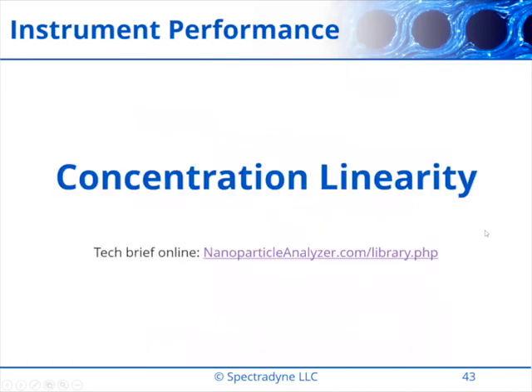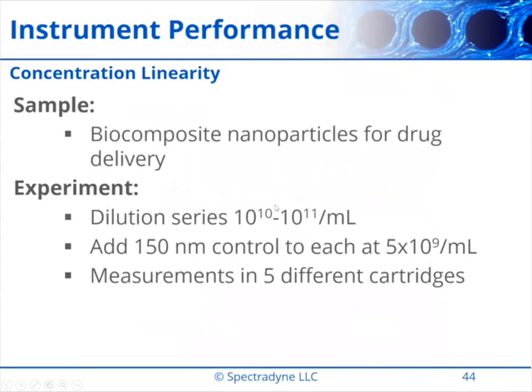Let me leave you with one more example. This is really more of an instrumentation study, but I think it's pretty nice data. So I'm going to show you measurements of biocomposite nanoparticles. These are actual drug delivery vehicles used by a nanomedicine company. So I've shown you protein aggregation measurements, some EV measurements. Now we're going for some synthetic nanoparticles from a nanomedicine customer.